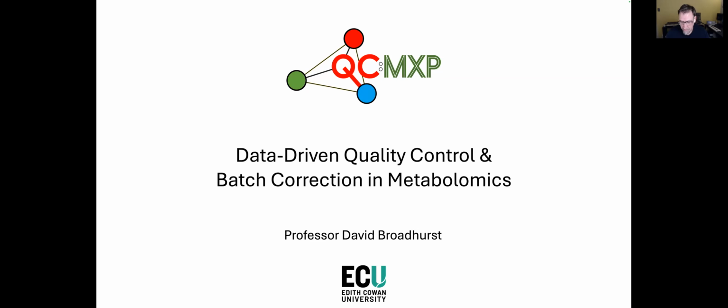I'm going to mainly be talking about my new software, newish, two years old now, software, QCMXP. But I will do just a very brief introduction. I'd like to save quite a lot of time for questions at the end, so I'll try and go through this quite quickly, and then I'll do a couple of examples on the software, and then we can ask some questions.